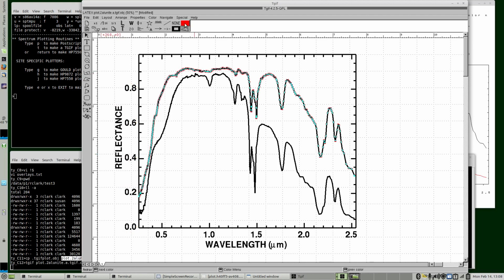Then you can change the colors. This is the color set. This is a default color set that I've set up. Usually you have just a few colors, but if you bring in an image or a color panel, it'll set the colors for you based on what you import. So let's make this one red and this one blue, just as an example.